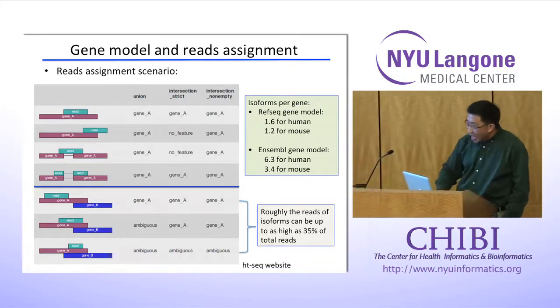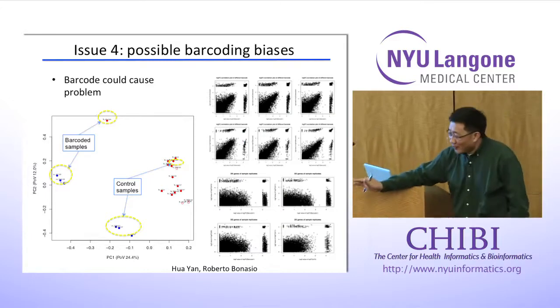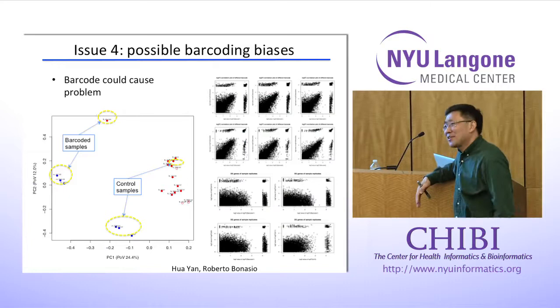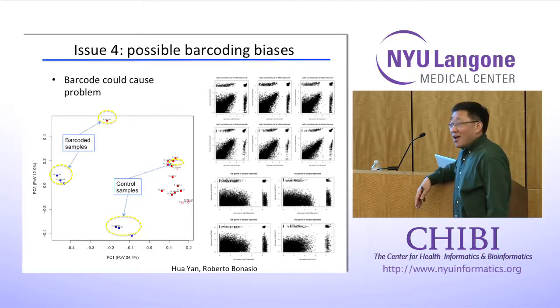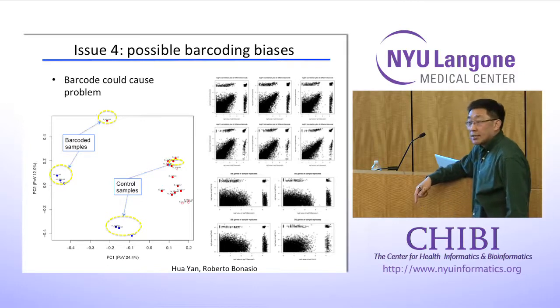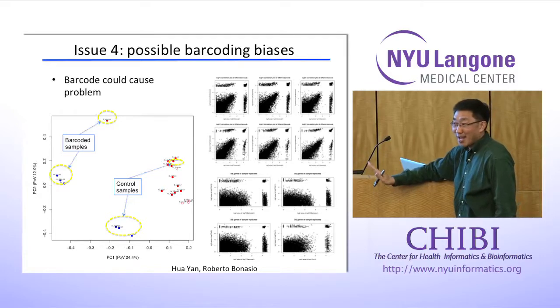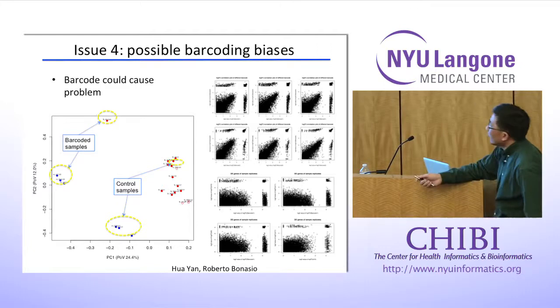So by this point, you may say, oh, I still get some good interesting results from TopHat or Cufflinks. What can I say? That's really good for you. But there are basically lots of false positives with TopHat Cufflinks. Okay, just keep that in mind.